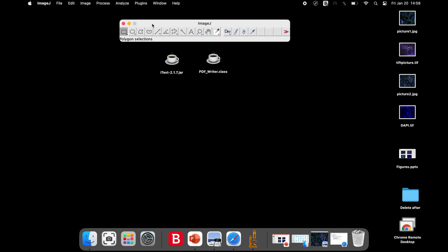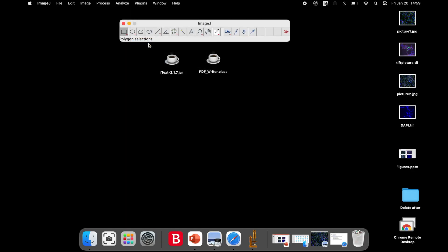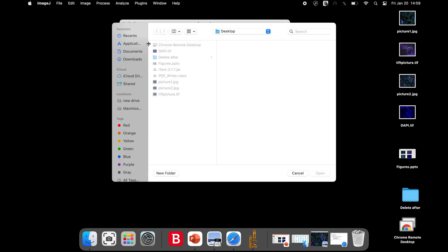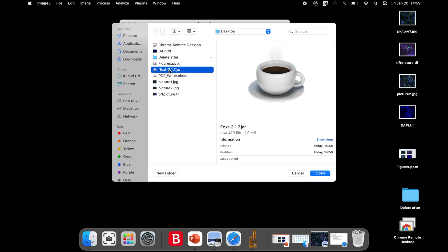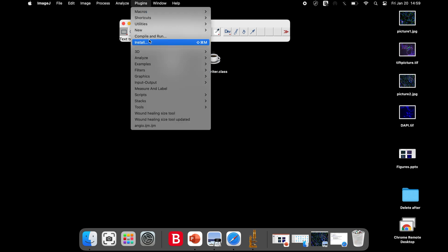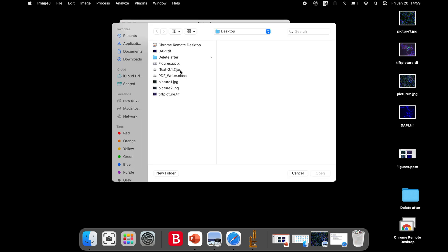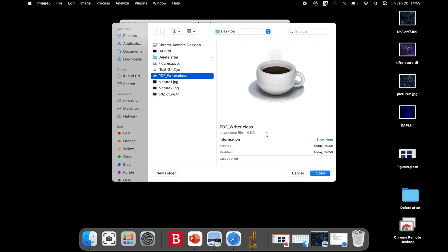To do this, click on Plugins, Install and select IText.jar and click Open. Similarly, install the PDFWriter.class by selecting the plugin and click Open and save it.